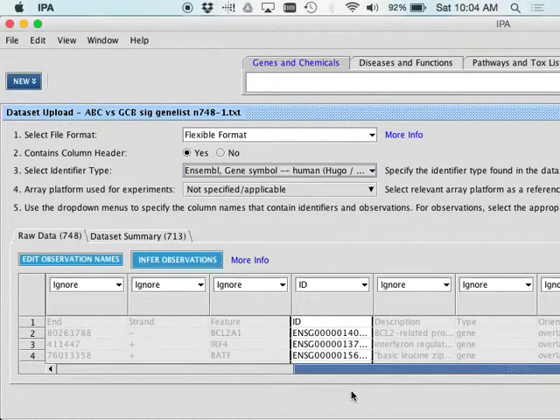No, you can leave it. It's fine. After that, your data set summary should say 713. Does everybody say that? Rock and roll.